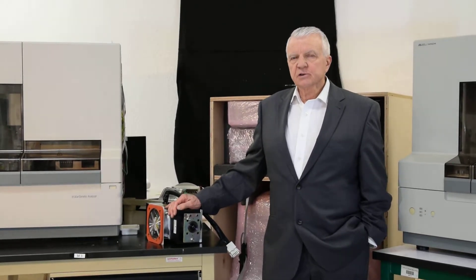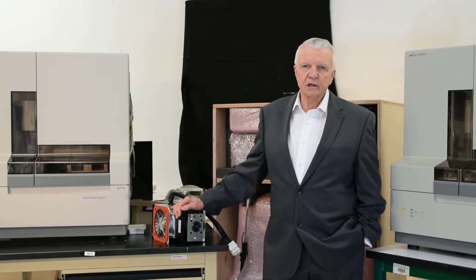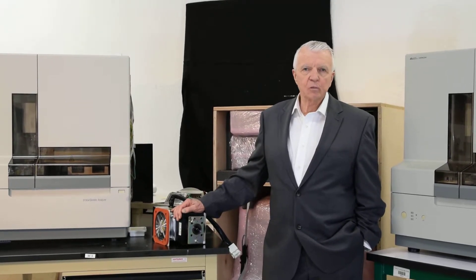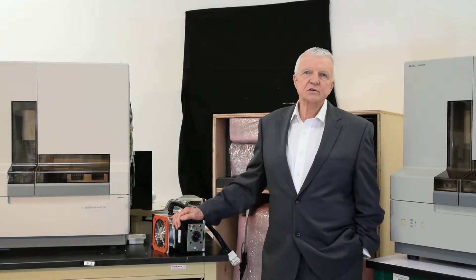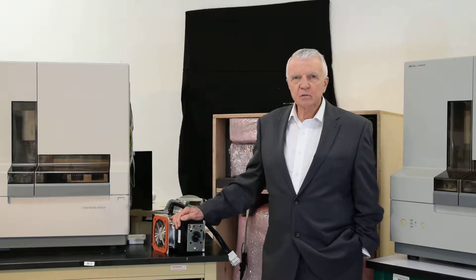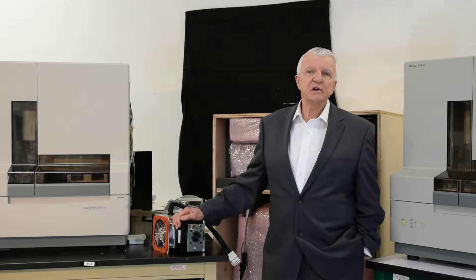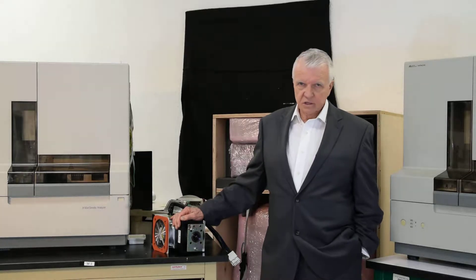When they start to burn, they're going to pull about a 5-amp draw, not a 6-amp draw as the OEM ones, and that will make a difference in years of service for you. When we sell an instrument, we want to give you a 1-year warranty on the instrument and a 2-year on the laser, because we know that these lasers last and last and last.